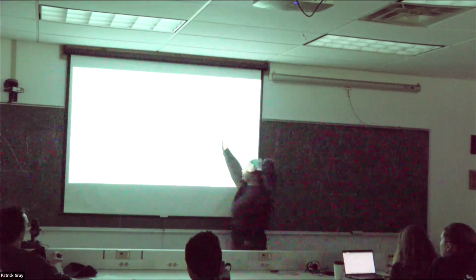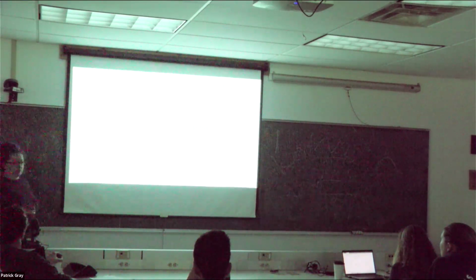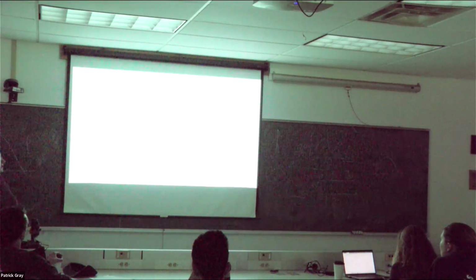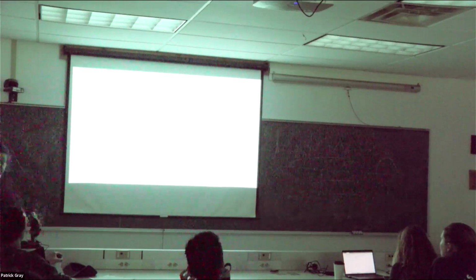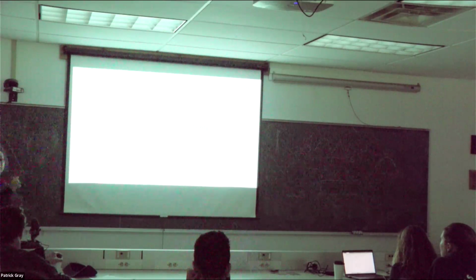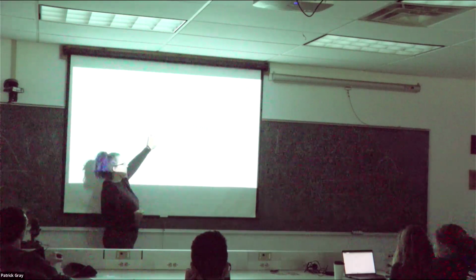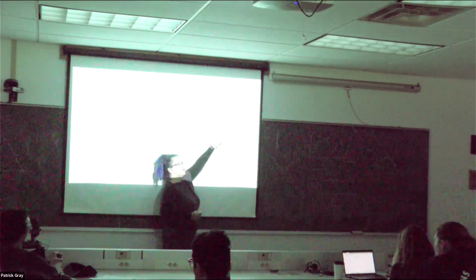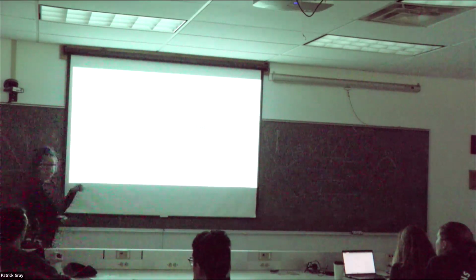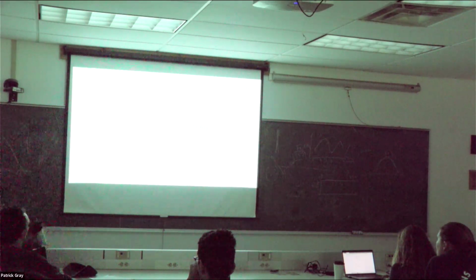This chlorophyll fluorescence yield is a very specific thing that people have measured. And depending on the solvent that chlorophyll is in, so remember, still talking about the molecule, that will change. The amount of light that is absorbed by the chlorophyll and is switched back at you as fluorescence is going to be different in different solvents. We usually dump it in acetone. It's 0.33 in acetone. And methanol is something else.